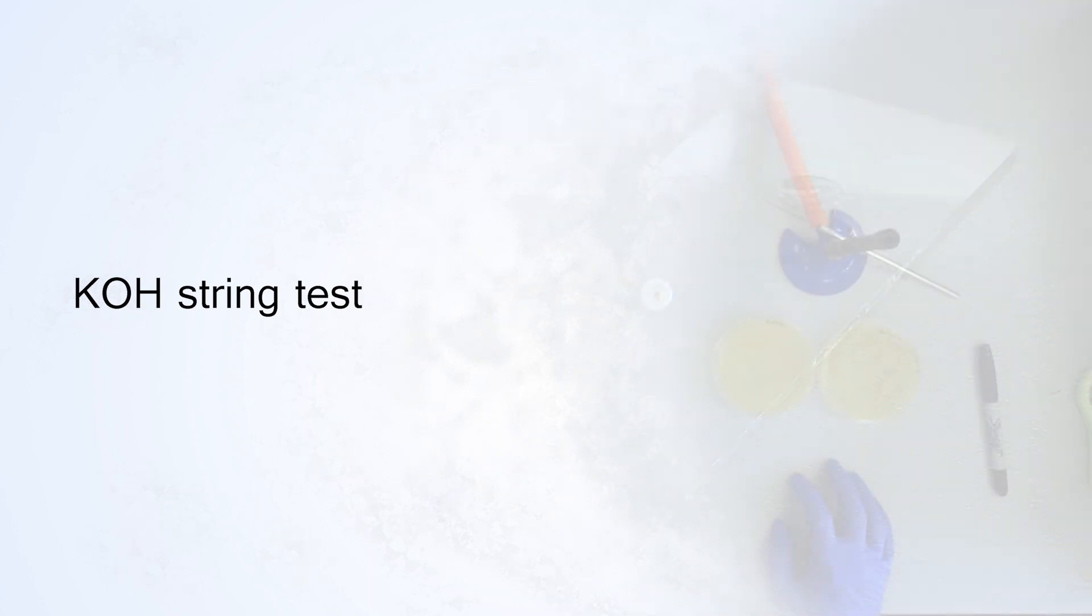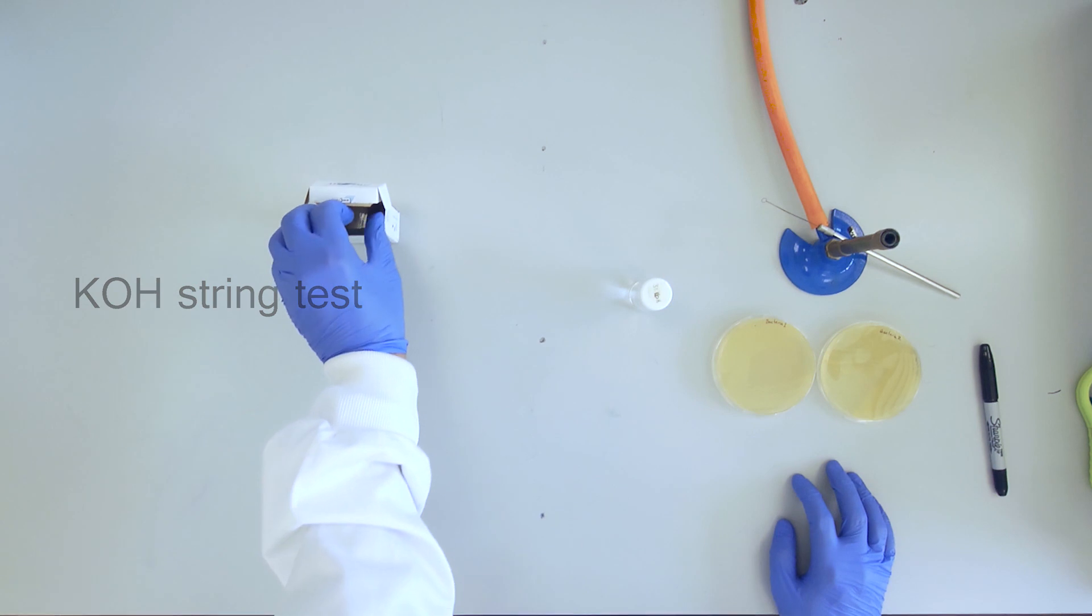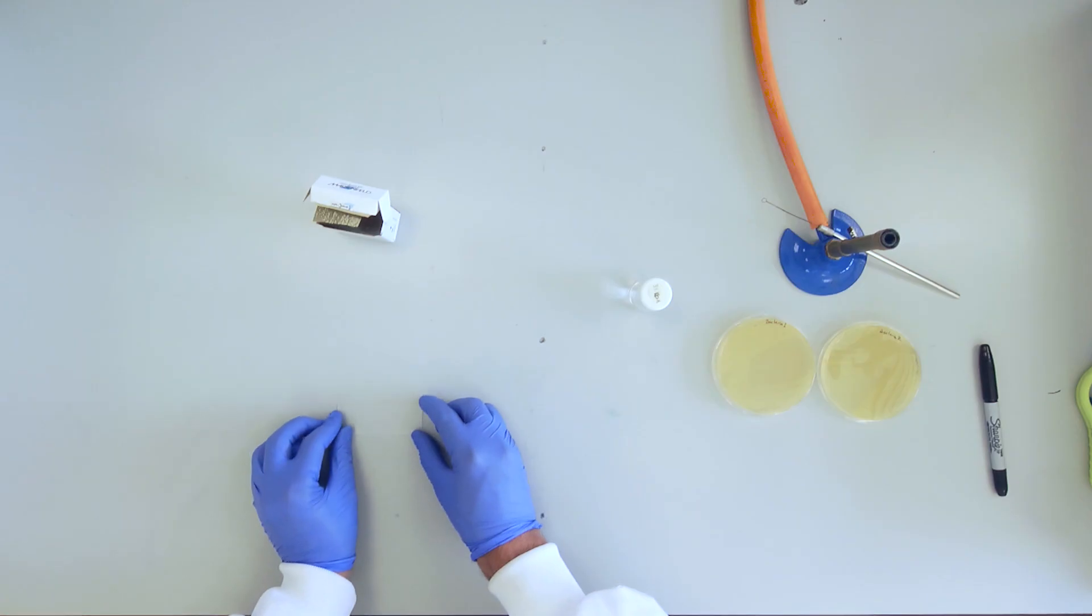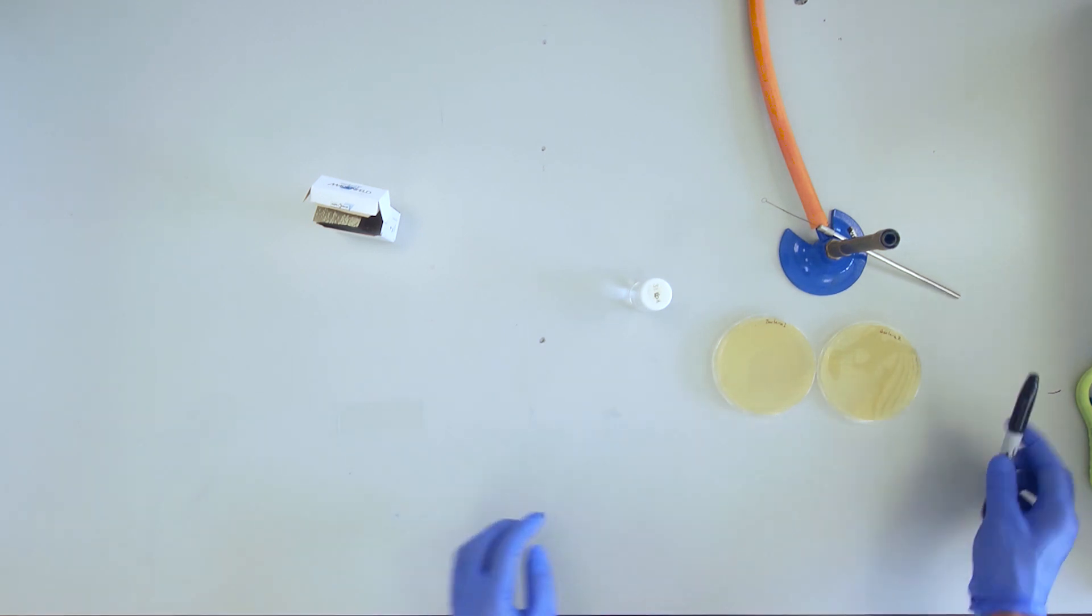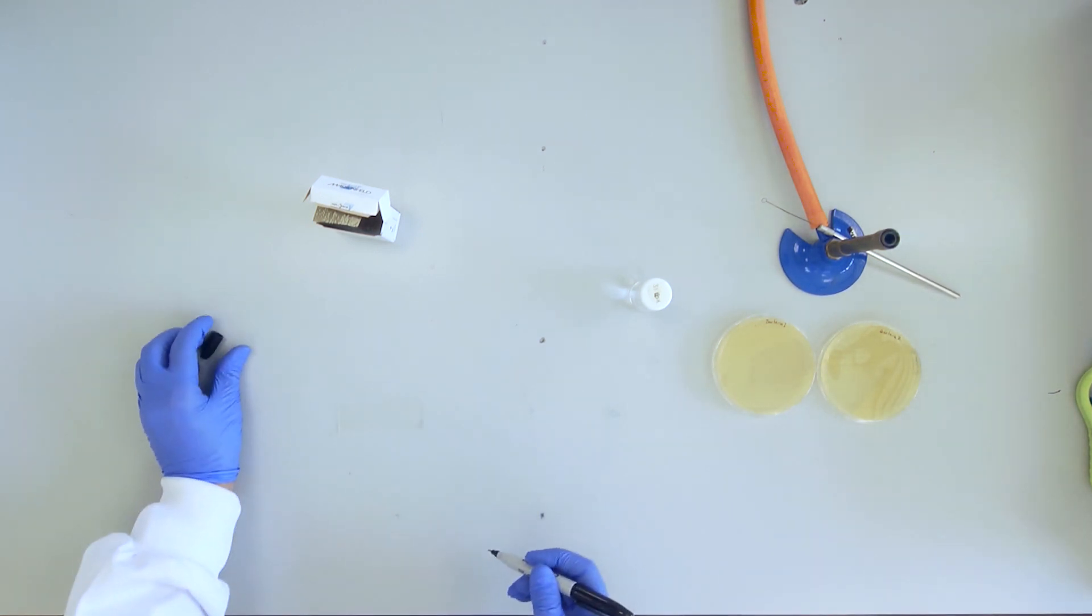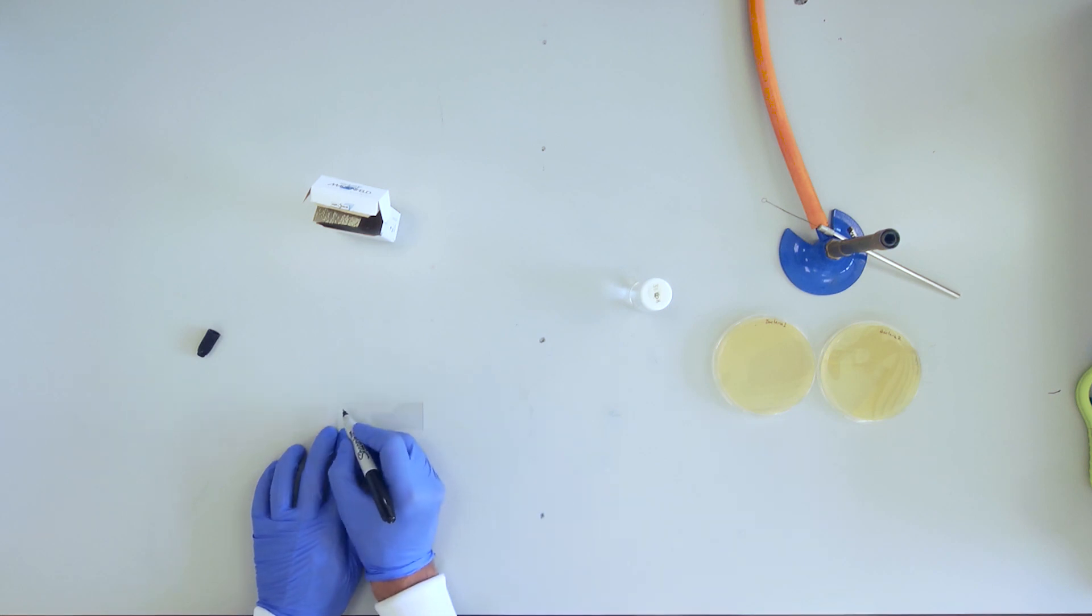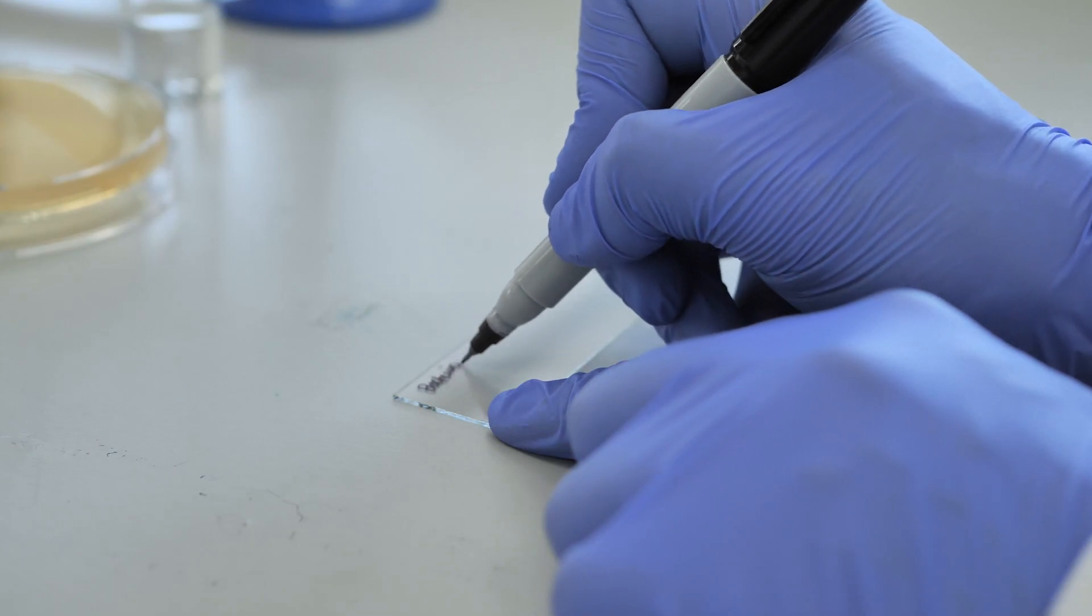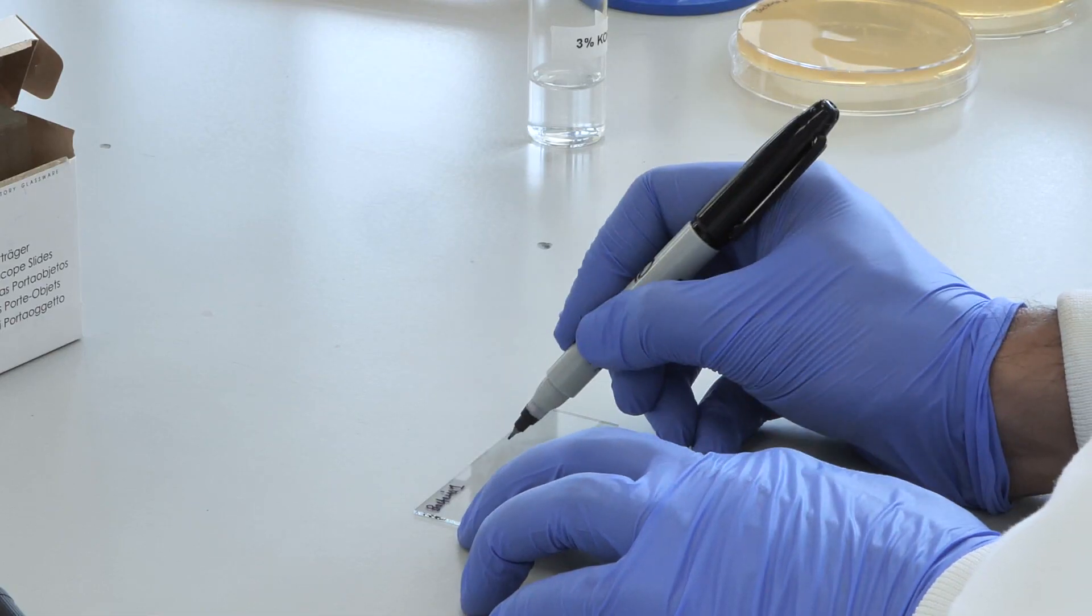KOH String Test. Label a slide with Bacteria 1 and Bacteria 2.